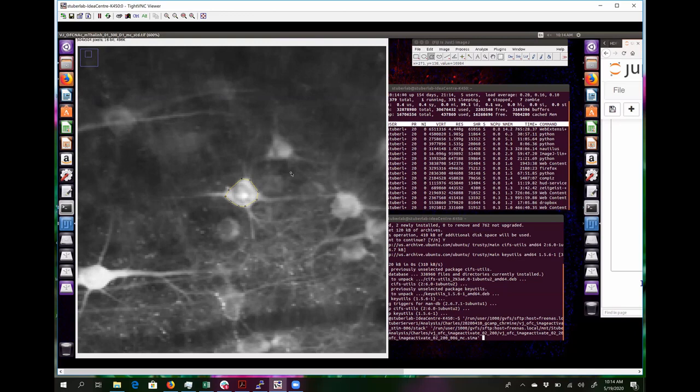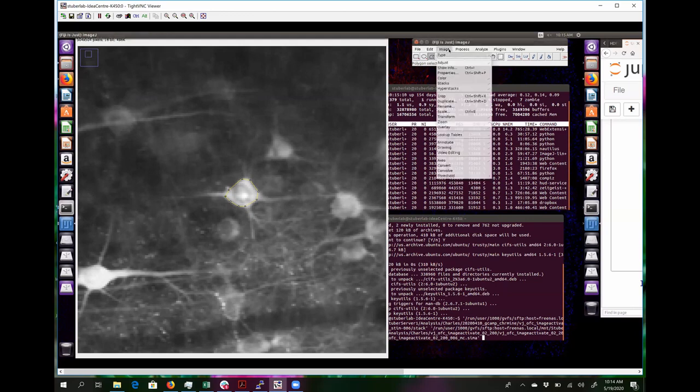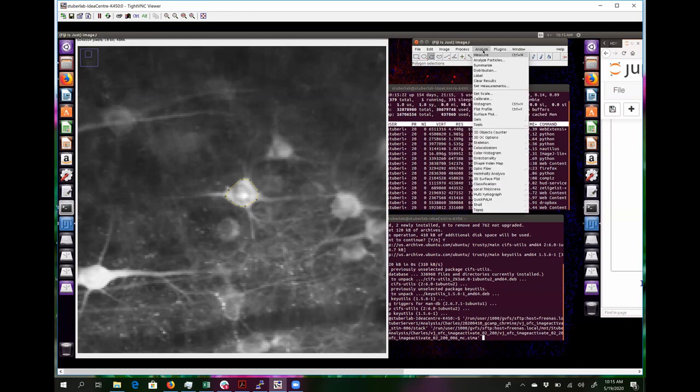Just to give you a sense of how you do this in ImageJ, you simply load your standard deviation projection in ImageJ and hit the polygon selection. You're going to use Sima to extract, so I would recommend using the polygon. There's also the freehand selection, which works pretty well, but Sima doesn't support it. I drew about 10 sessions without realizing that. That's a problem, good to know. So always stick to the polygon one.